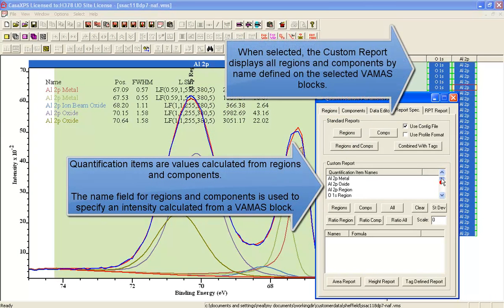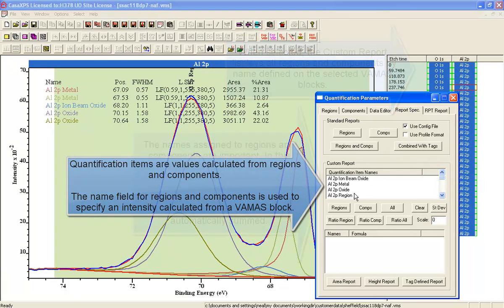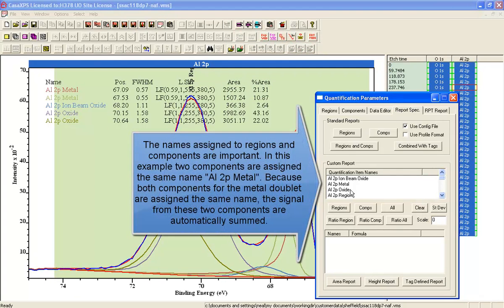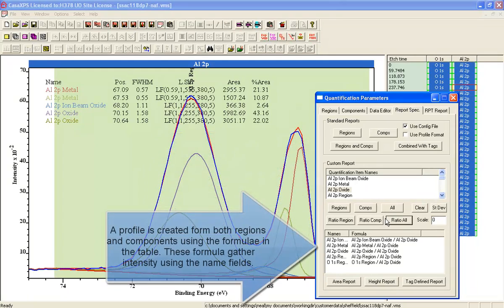So having assigned the same name to these components, we just need to give that name in order to collect signal from either the oxide or the metal.